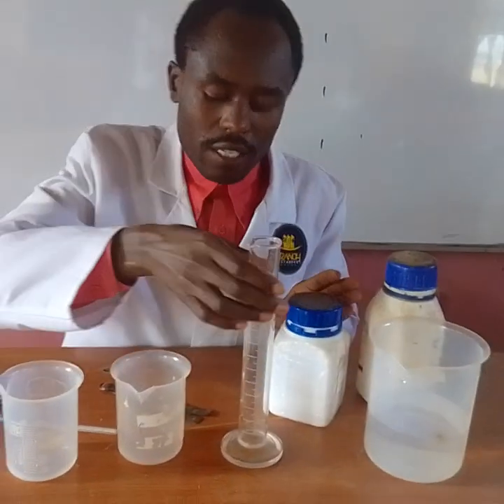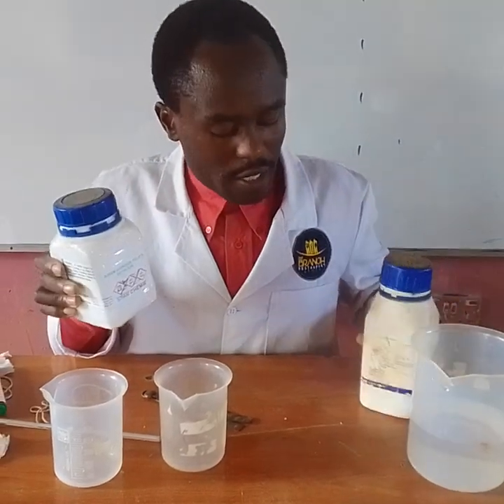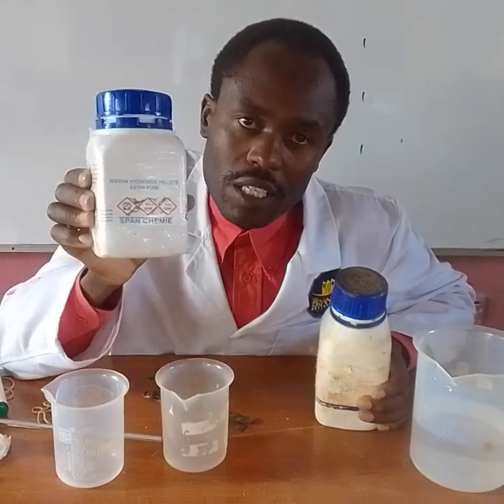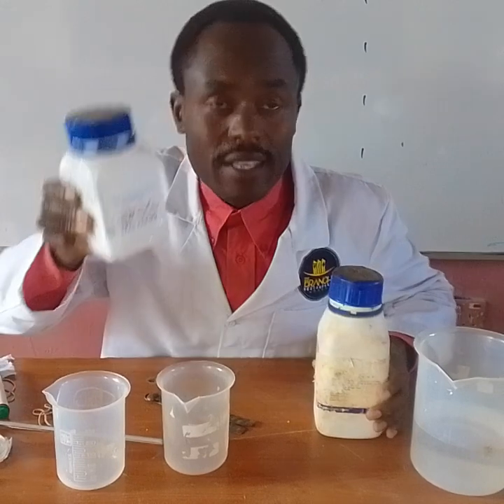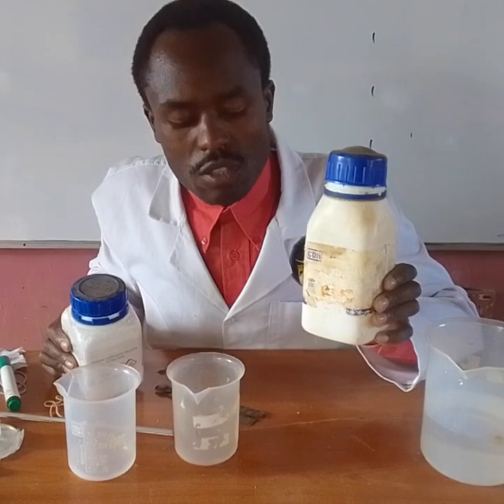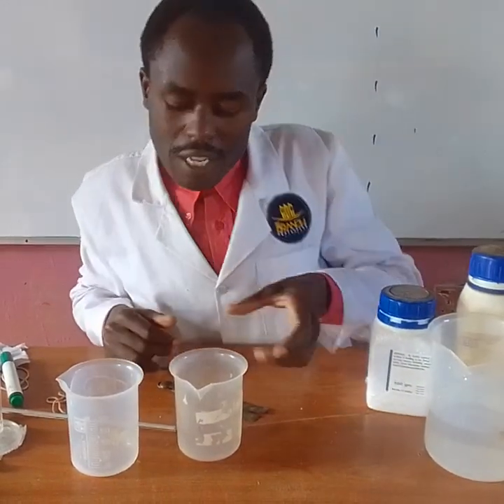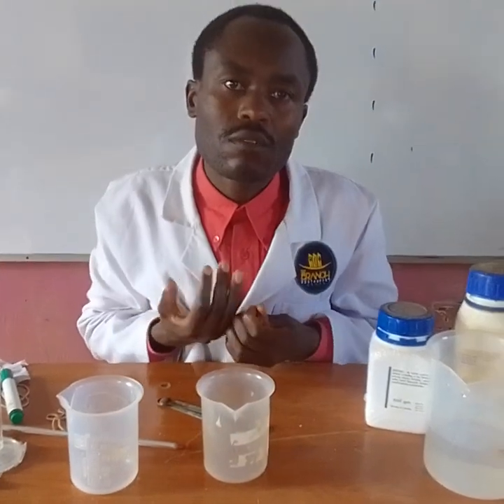Then I have the salts. I have two reagents. One of the salts is sodium hydroxide. Then another one is ammonium nitrate salt. So my student, I want now to take you through the procedure. It's a simple exercise that takes only about 15 minutes.